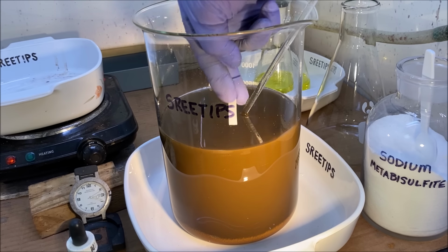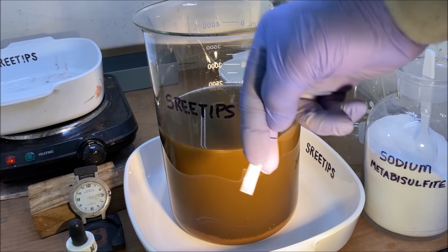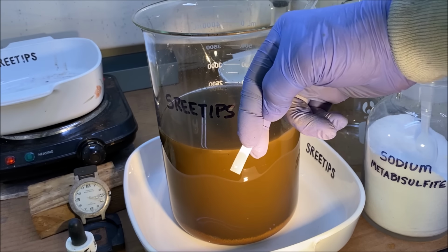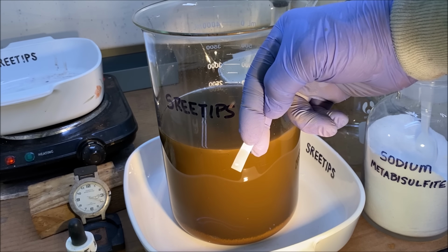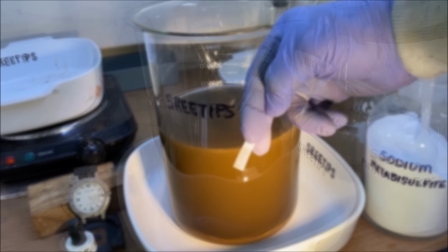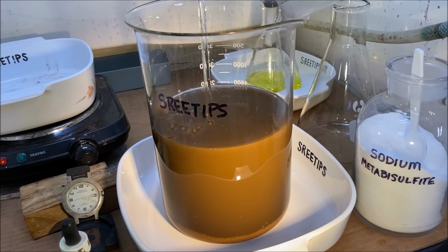Sure, we've got it now. There you go. Negative stannous test. All the gold has been precipitated. So we'll just go ahead and let this settle now.